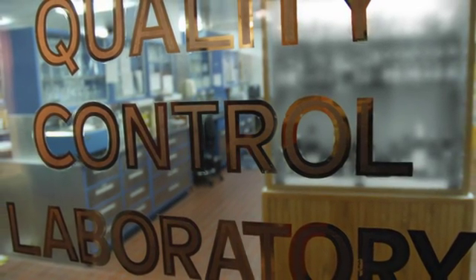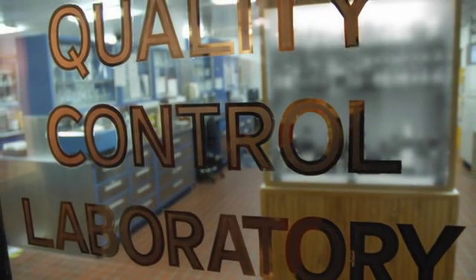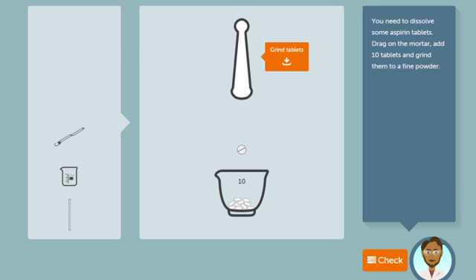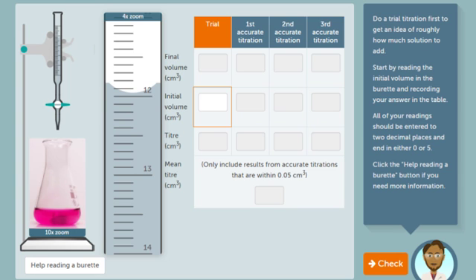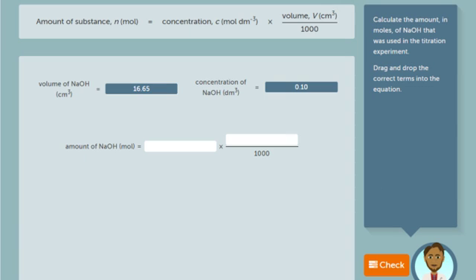In this activity as a quality control chemist at the aspirin manufacturing plant, you will perform a titration experiment to determine the exact amount of aspirin in a tablet from the test batch. You will need to check that the results comply with the quality standards at the plant.